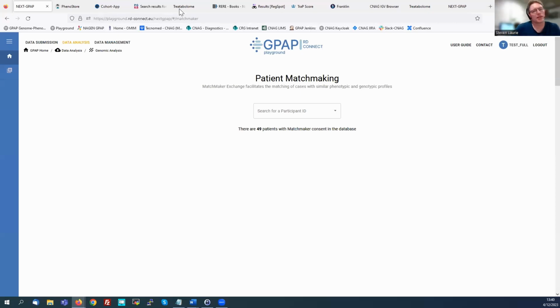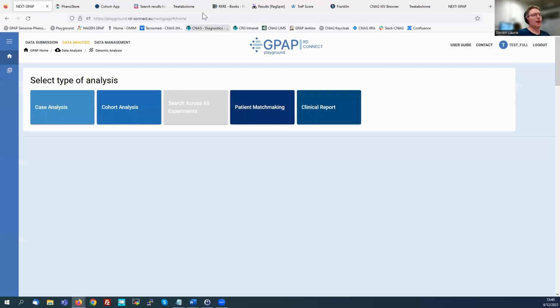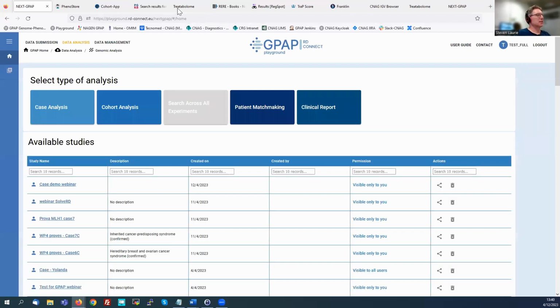Yeah, so essentially if anybody adds a sample to another endpoint tomorrow and you do the search again tomorrow and that sample is one of the matches, you will get a different result. You will get that match. So it's live in the sense that there's nothing stored. As soon as things are made available in any endpoint, if you rerun the query, you will get a different set of results if there are other things that match, obviously.